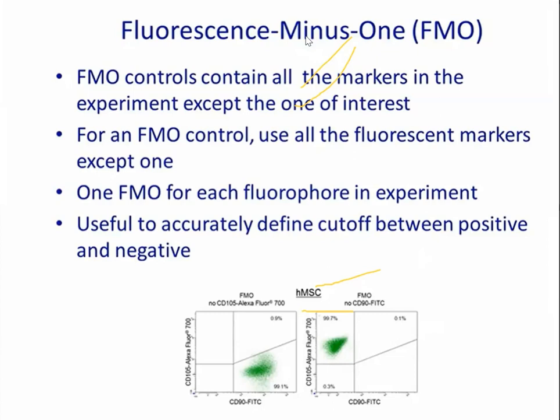Is it clear? Yes. If beads bind to any fluorochrome-labeled antibody, then how do we differentiate the negative and positive population? See, I told you now, the comp beads are a mixture of two beads. One will not have anything on its surface, so it will act as the negative one. One will have anti-kappa molecules, so if you add antibodies, they will go and bind to it. So when you run the beads together, you will get two populations. Correct? Dr. Anand, are you getting me?